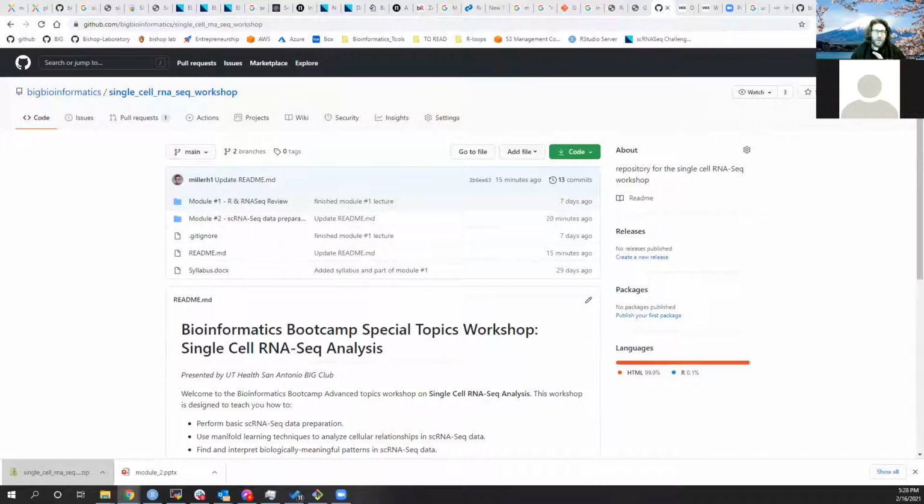I know this is a single cell RNA-seq workshop, and we're not trying to teach you Git here, but in my opinion, one of the things that is really hard when you're first starting out with single cell, or really any sort of bioinformatics, is that there are all these little things that computer scientists know how to do that you don't yet know how to do, and it's not obvious how to do them because you don't necessarily have a CS degree. So this is really for people like that, to show how you can do things like working with Git.